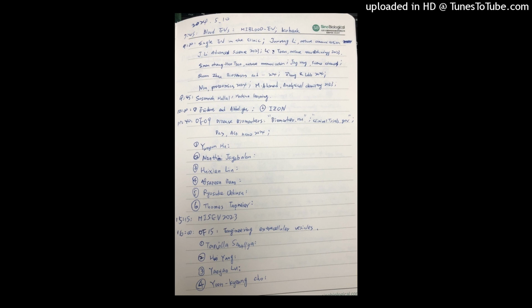I don't know how to solve that problem, but I think it's difficult because probably in one lab it will be 20 degrees, in the other 23 or whatever. So there are so many variables. So I think in the end, giving recommendations there that people do measure, for example, platelet concentration simply as a measure to check the efficacy of the centrifugation procedure, I think that would be easier.